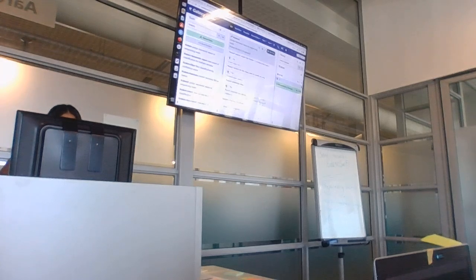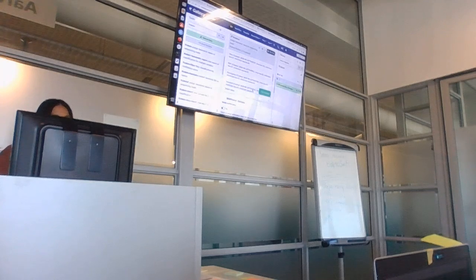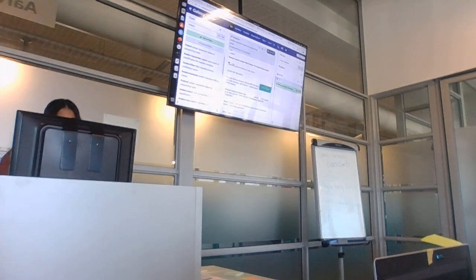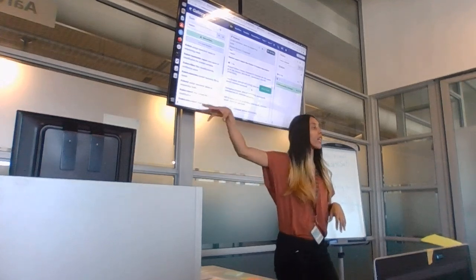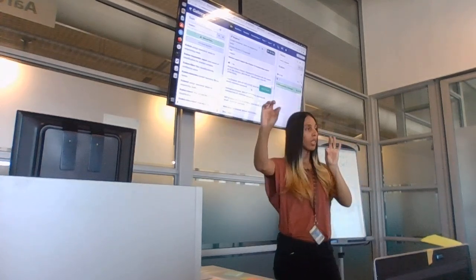But the database I chose, I'm taking the standard look. I actually didn't run mine on standard. I'm telling you to run it on standard. And I'm telling you because I took this RefSeq one that has a whole bunch more databases. These are databases that it's going to check your sequence against, right?